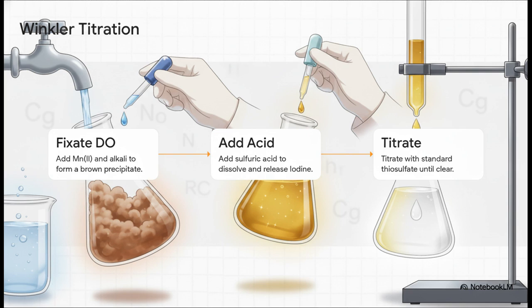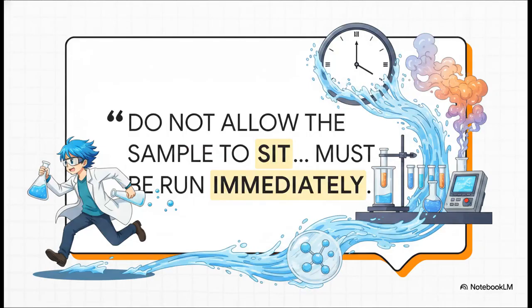It's a beautiful, color-changing visual cue that makes complex chemistry feel as approachable as following a cooking recipe. But there is a massive catch when you're doing this manually. As the Massachusetts Institute of Technology Laboratory Manual stresses in all caps, do not allow the sample to sit for any length of time. The sample must be run immediately.